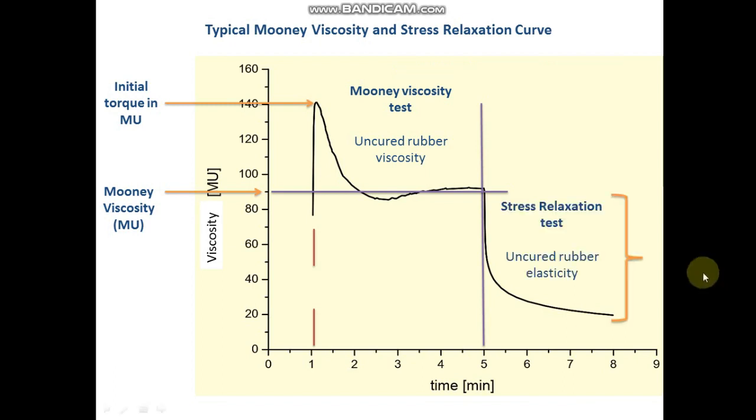At the 5th minute, the rotor will stop suddenly. Then the decay of the torque will be recorded.